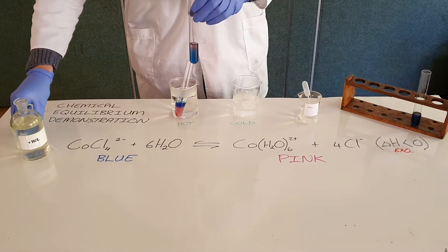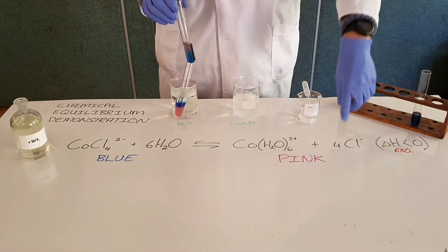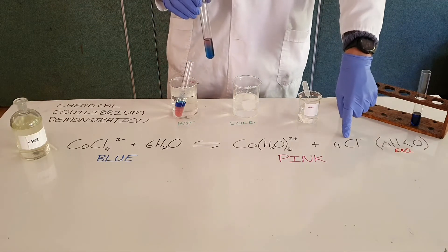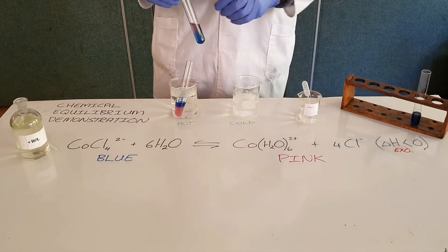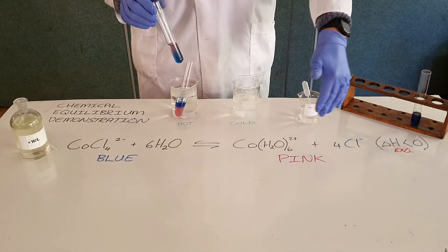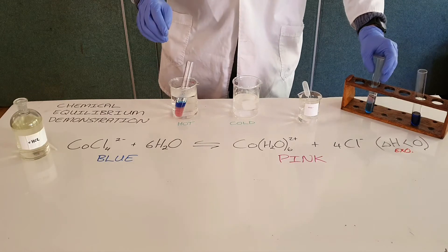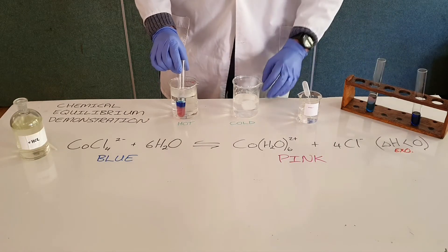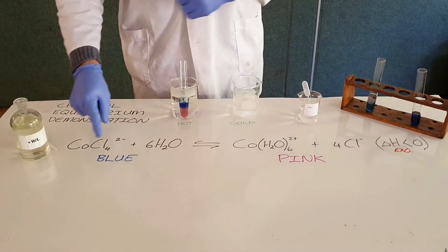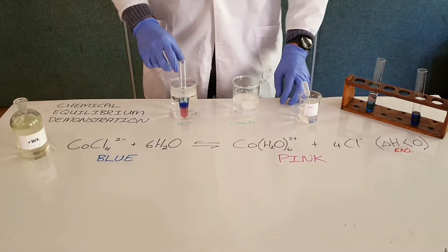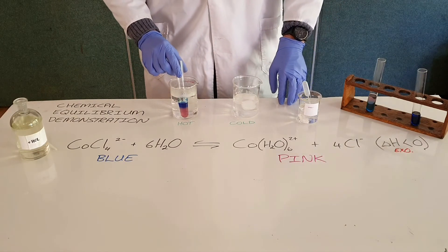It's important to note that the common ion effect means it is not necessary to add specifically only chlorine. You can add something that contributes to the overall number of ions, and that will still change the concentration and therefore the equilibrium position. In this reaction, we have very clearly favored the reverse reaction. The reverse reaction produces more cobalt chloride, which is blue in color, and we can see we have produced a more blue solution.